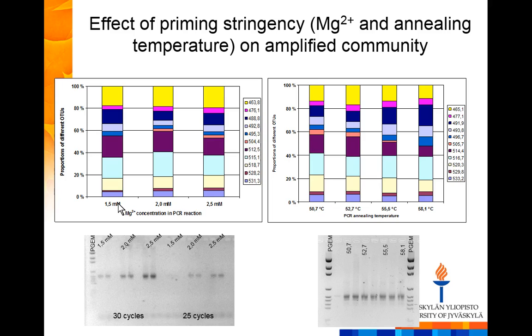Yeah, exactly. We call our primers universal primers, but they are not necessarily truly universal. You can easily have one or two base mismatches, and you expect your primers to work with one mismatch, but the annealing temperature will be lower. So you will have bias if you use very high temperatures.